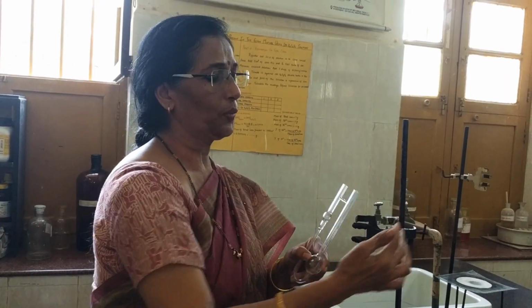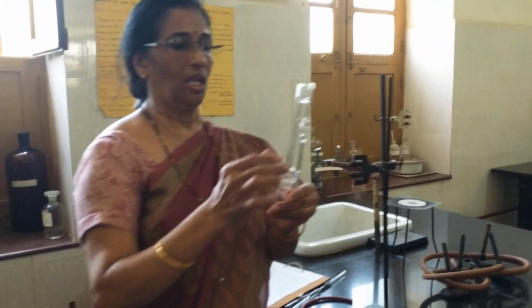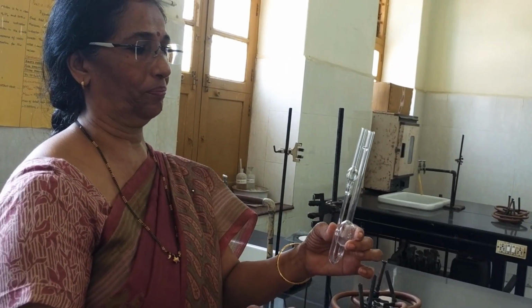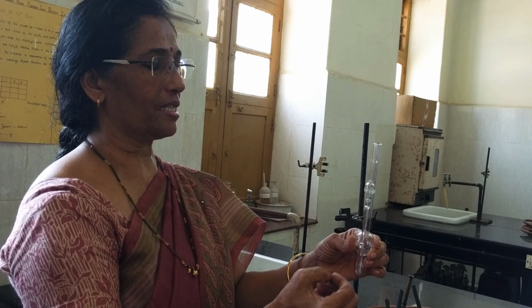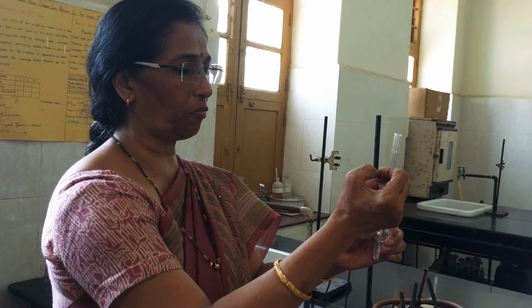So this part 2 is the determination of viscosity. We use this apparatus which is called the Ostwald's viscometer. How do we define viscosity? Viscosity is defined as the resistance that is offered to the flow of liquid.